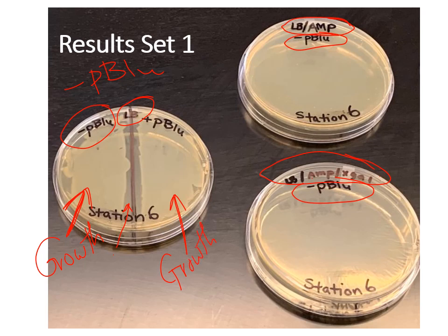Now in pictures it's tough to tell, so I will tell you that this plate and this plate, they are no growth, okay? You do not see any outlines. You notice on this plate how you can see those weird outlines. That shows a blob of growth. You don't see any circular colonies, which you'll see on the next slide.